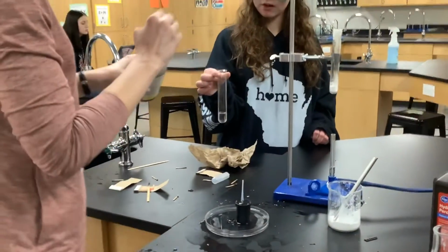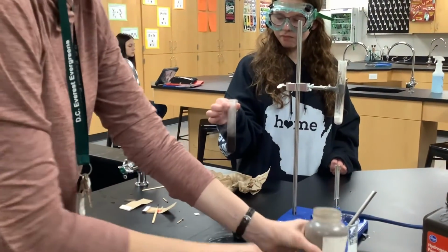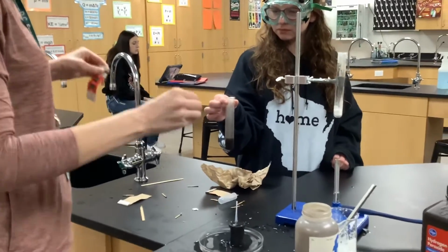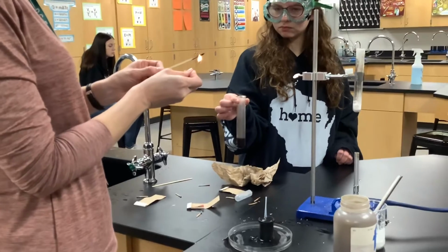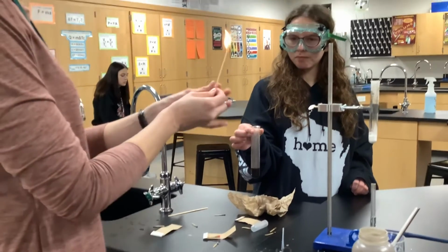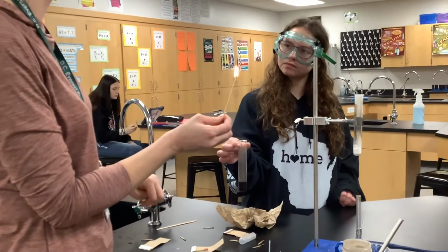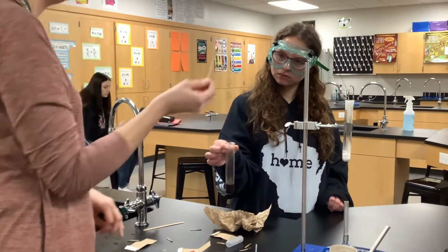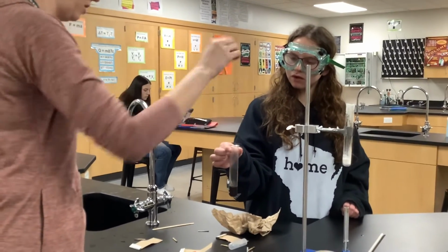So we're gonna add this manganese dioxide to catalyze it. Right there. And the oxygen gas that it's producing is ever so slightly more dense than regular air, so it is gonna sit at the bottom there. Okay, if we let this burn and it's producing oxygen gas in here, and then we blow it out where there's still embers and then put it in, what is it gonna do? Light up. It's gonna light back up. Because what do you need for fire? Oxygen. Oxygen. We already used it all up.